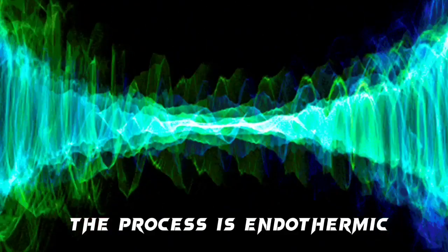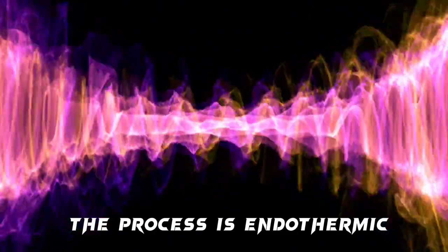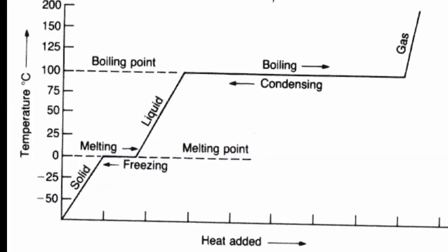The process of melting requires extra energy, it is endothermic. When all of the solid has melted, then the temperature of the liquid will start to rise.